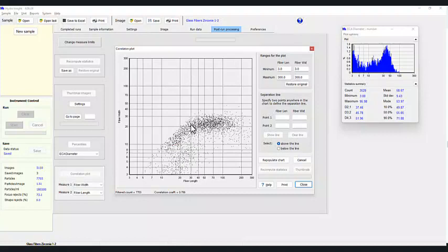Just to validate that, let's look at a specific region. Let's look at an area of length anywhere from, let's say, 30 to 50 microns in length, but a pretty tight width. We're going to look from 20 to about 30 microns in width, and then we can say, okay, this is the region that we really want to pick on. We're really interested in this specific area of particles for whatever reason.